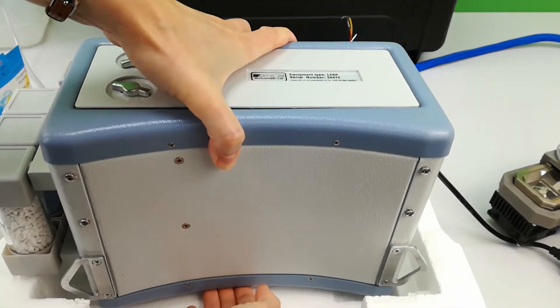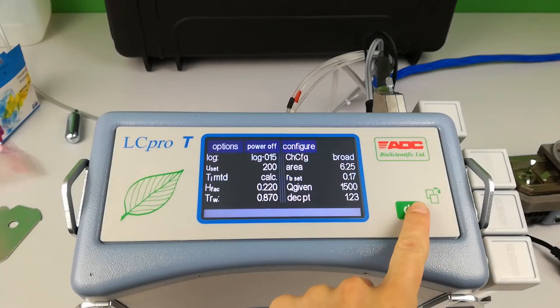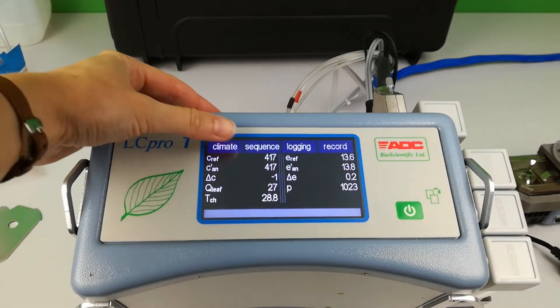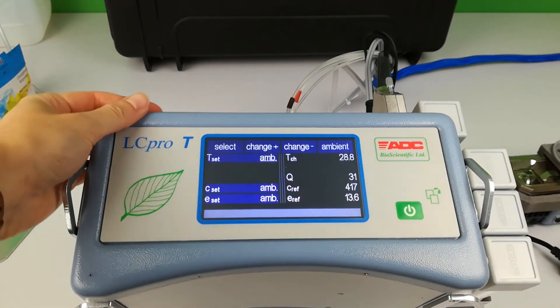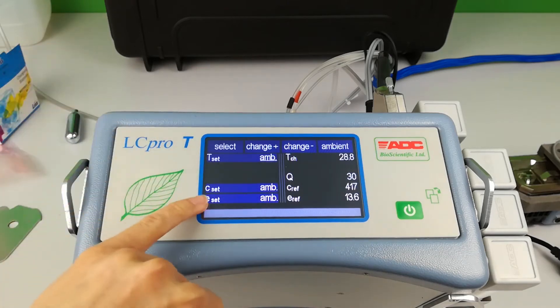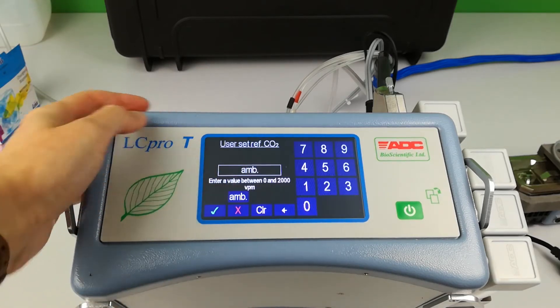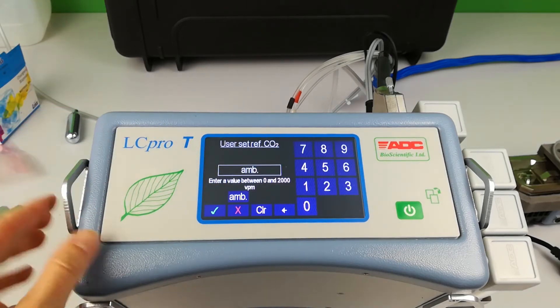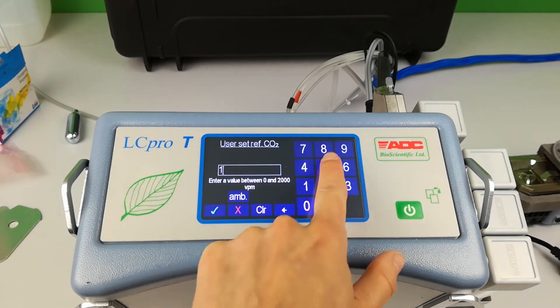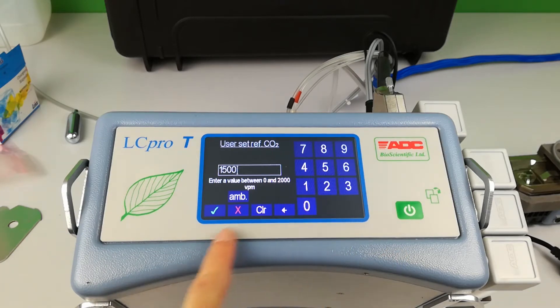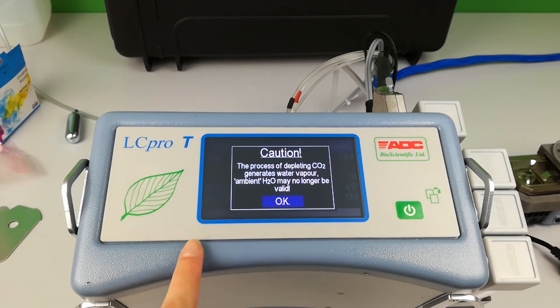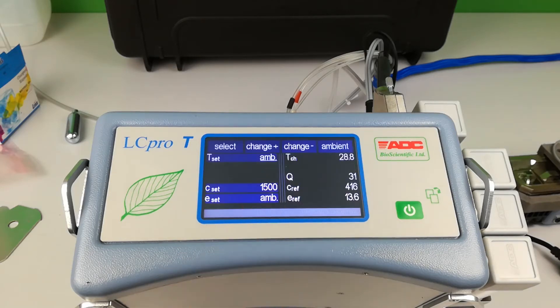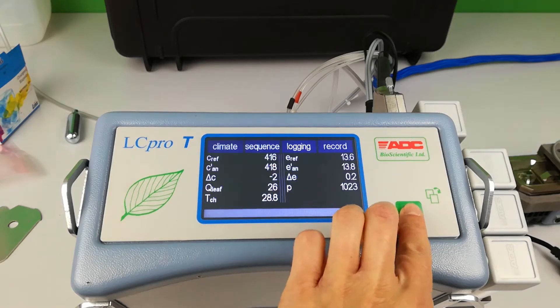To control the CO2 concentration using the software, enter the climate menu and select CSET to control the reference CO2 concentration. Default is ambient. Use the keypad to enter a value and the tick icon to select and confirm. The pop-up message can be ignored at this point.